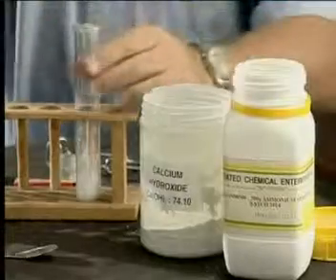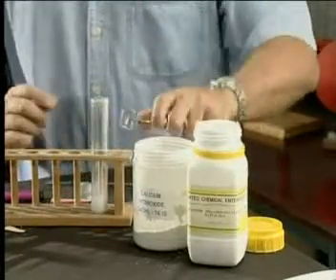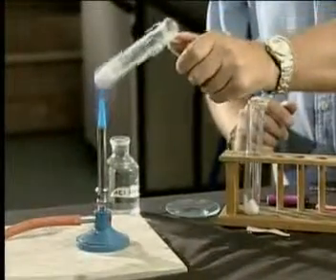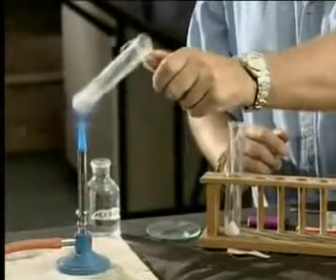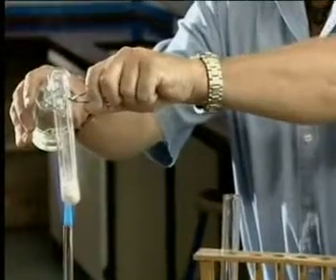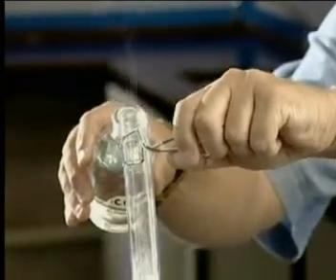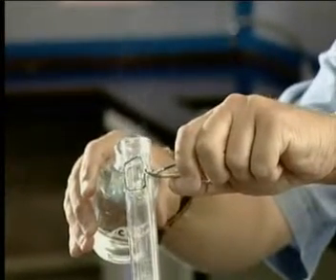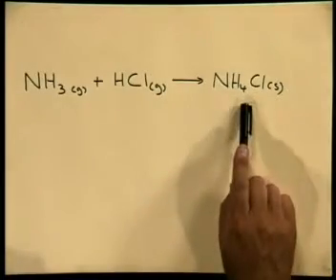There is also another very simple test for ammonia which we can perform. We need to repeat the initial steps of our previous experiment. I'm now going to heat the test tube again over the Bunsen, making sure that I shake it to generate as much gas as possible. What I'm now going to do is bring a bottle of hydrochloric acid near the neck or mouth of the test tube. Can you see thick white fumes forming at the mouth of the test tube? This is a positive test for the presence of ammonia. In this reaction, the ammonia gas combines with the hydrogen chloride gas to form the solid substance ammonium chloride, observed as thick white fumes at the neck of the test tube.